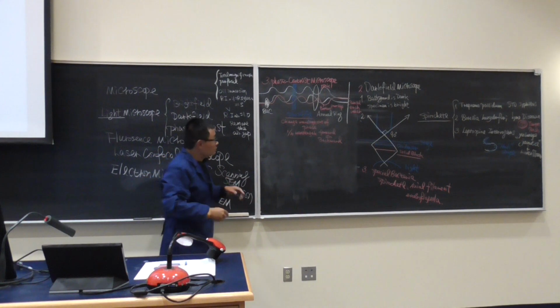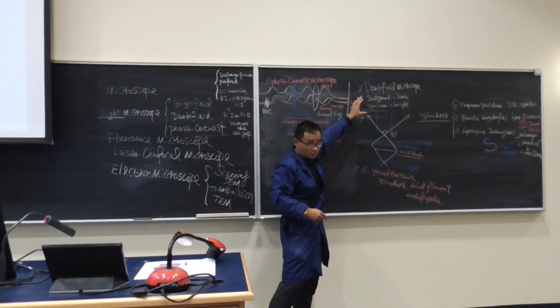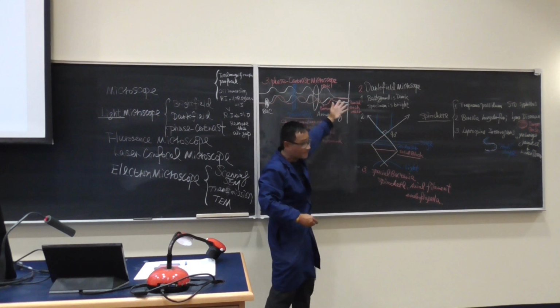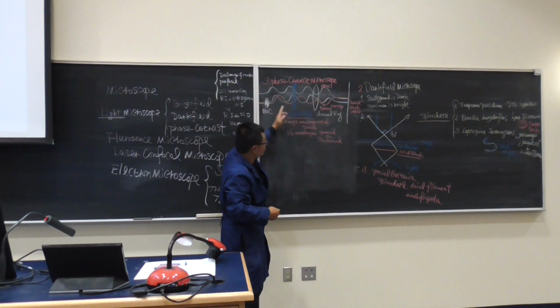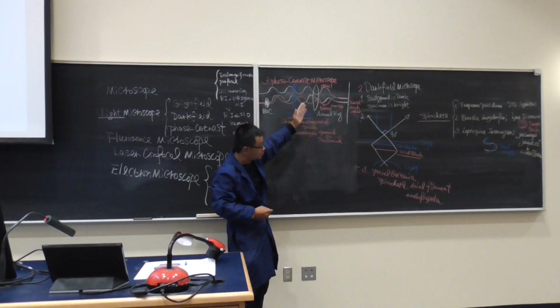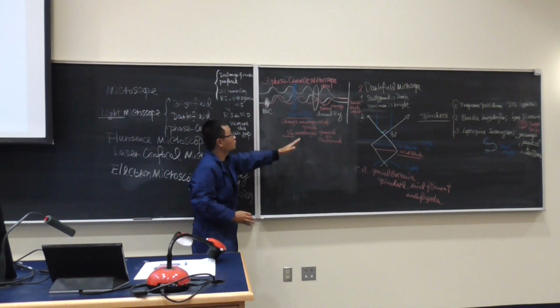So, said very simply, originally you're not going to see anything. When they're going through the condenser, going through the objective lens, you see some light there, some reflection. But when I put a phase ring there, the wavelength, the speed is going to change, and the morphology is going to change. It is around 1/4 wavelength forward or backward.